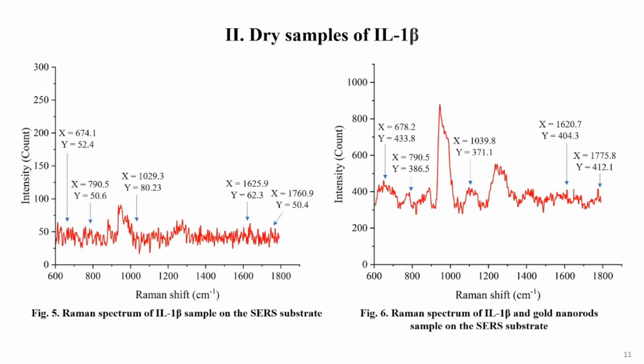Now talking about the second part, which was interleukin 1 beta. More than talking about characteristic peaks, we have to also focus on something called characteristic patterns of the inflammatory biomarkers which can be observed. So here, the pattern what I'm talking about is these peaks that I'm mentioning. They are all following a particular trend. So this trend has to repeat in all my experiments. So I should show that they are replicative so that I can conclude that these are the characteristic peaks.